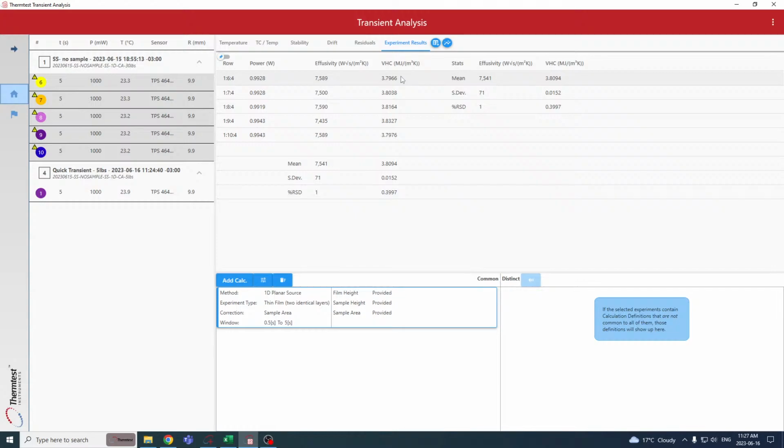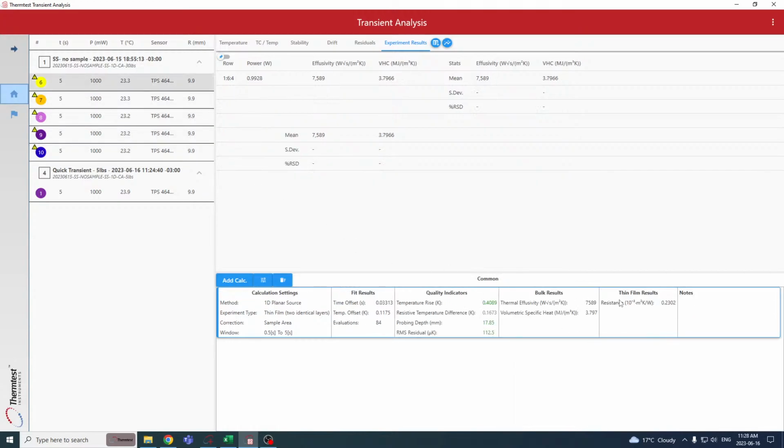That's a measured property, volumetric heat capacity and thermal effusivity, and that's a very good value for an unknown property on secondaries. That gives me a lot of confidence, when I click the individual row, in the resistance that it measures across piece A to piece B. So that is the measured material. If we had introduced a film in there, the film would be the resistance, but because we have no film, it's measuring dry. And that's at 5 pounds. Sorry, that's at 30 pounds.